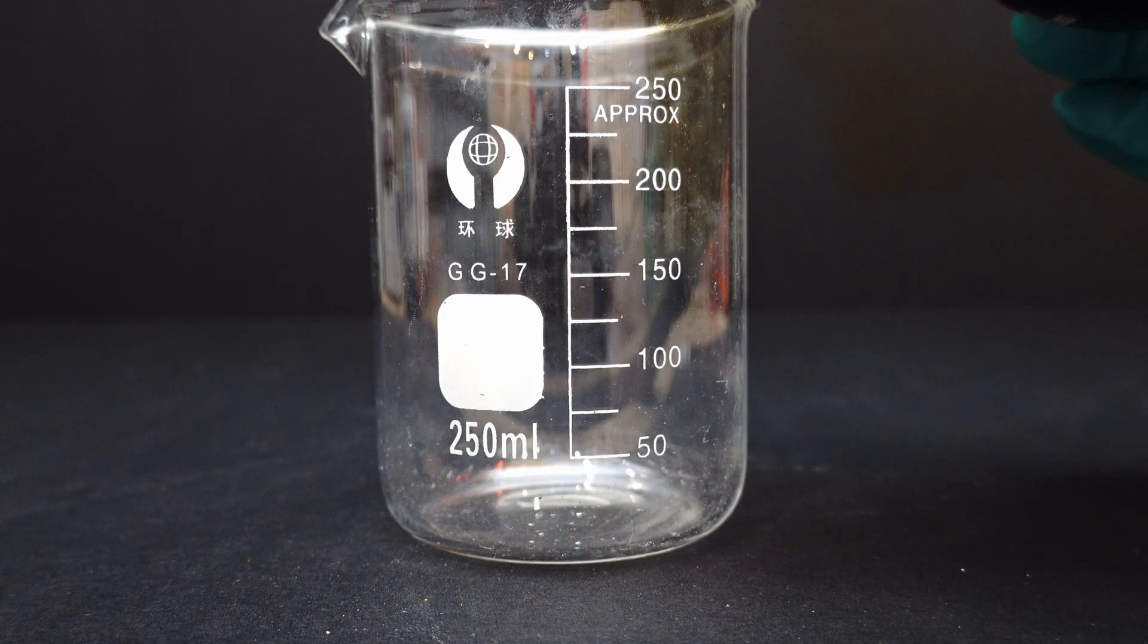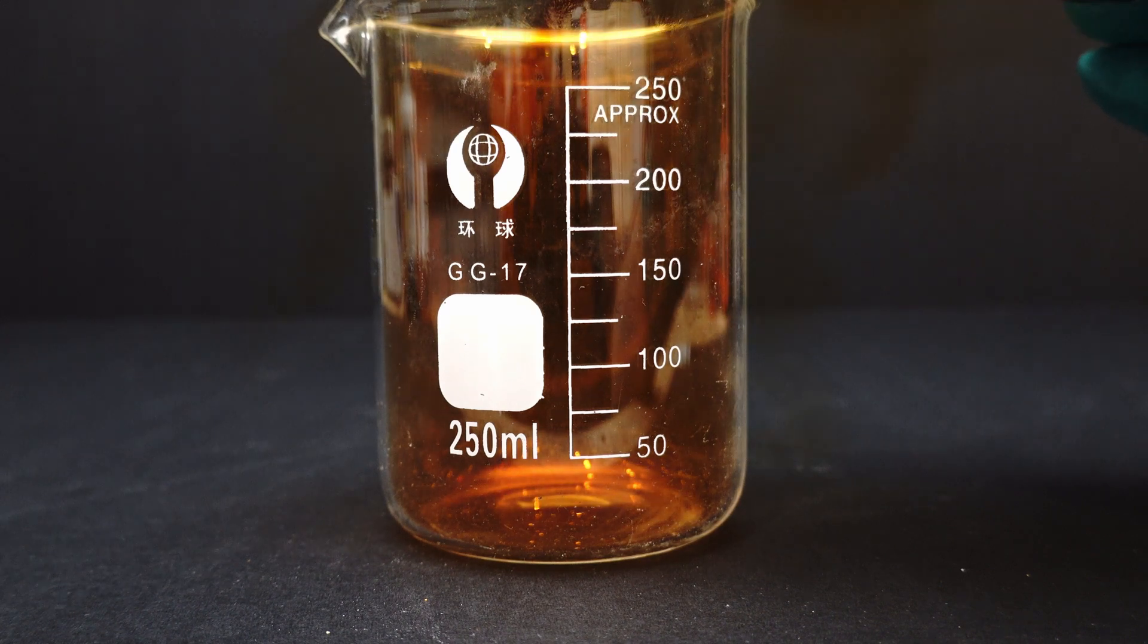Bromine fumes are also denser than air, so when I pour it, you can see all the vapours flowing down like a waterfall of sorts.